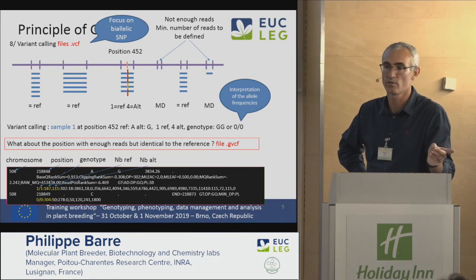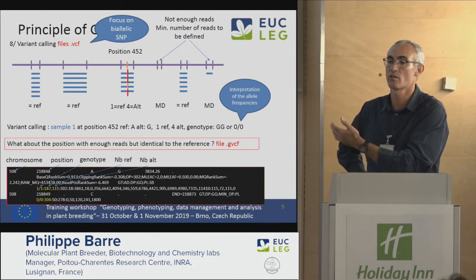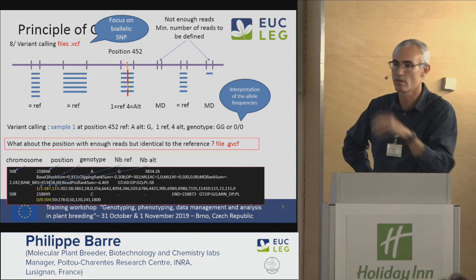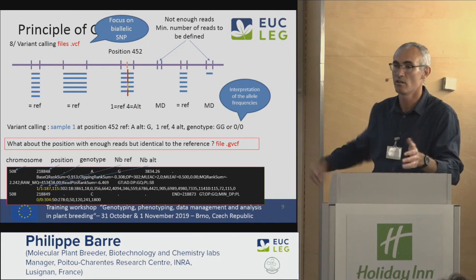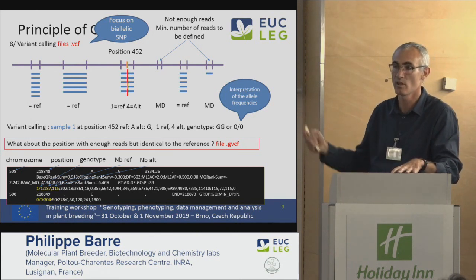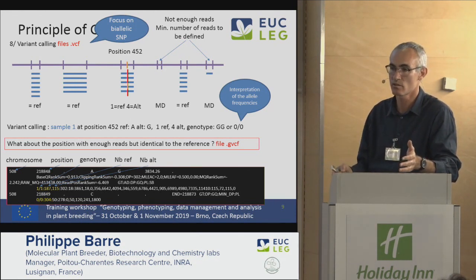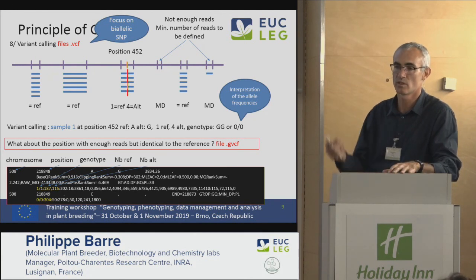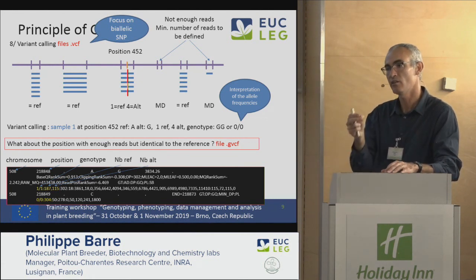So I agree, but often you don't know exactly what the software is doing, and when you check, you can't check everything, but you pick some SNPs and you check, and sometimes you say no, it's not possible. For example, GATK, which is a software, how could it say there is a heterozygous there? I don't trust that. Often when you look at the distribution and you see a drop, there you really see your threshold, and this is something I trust.